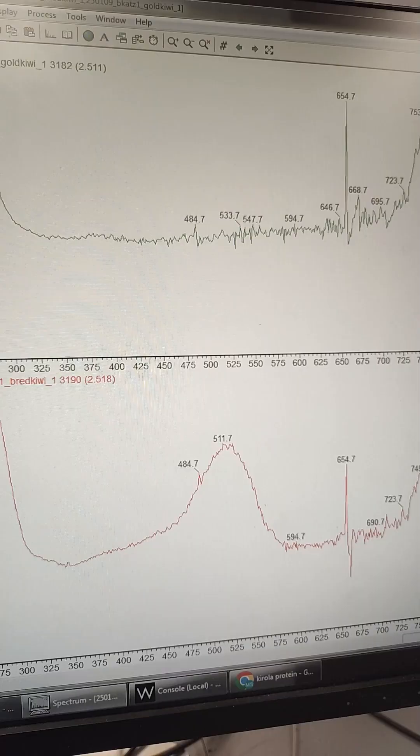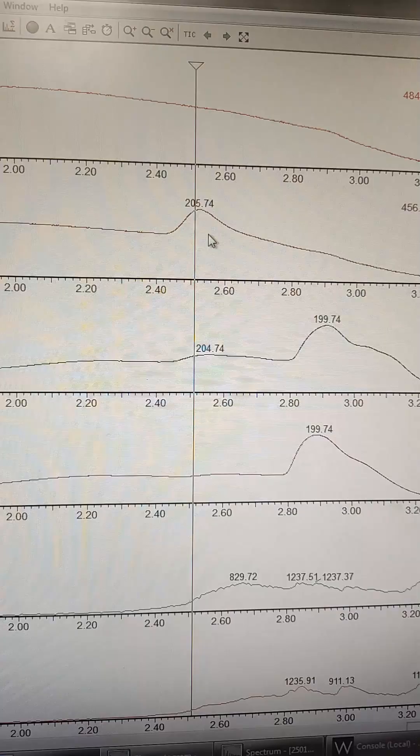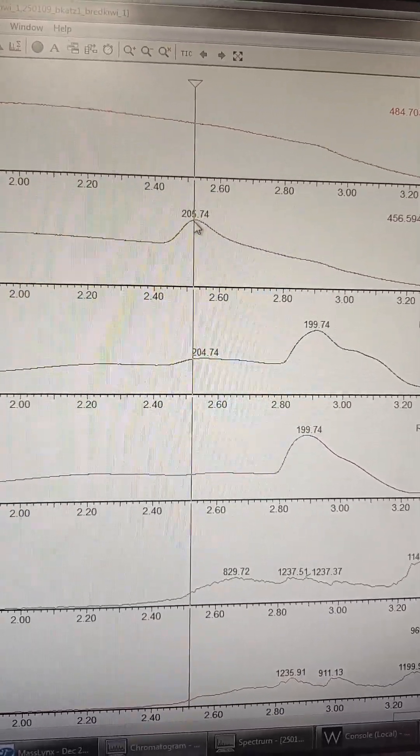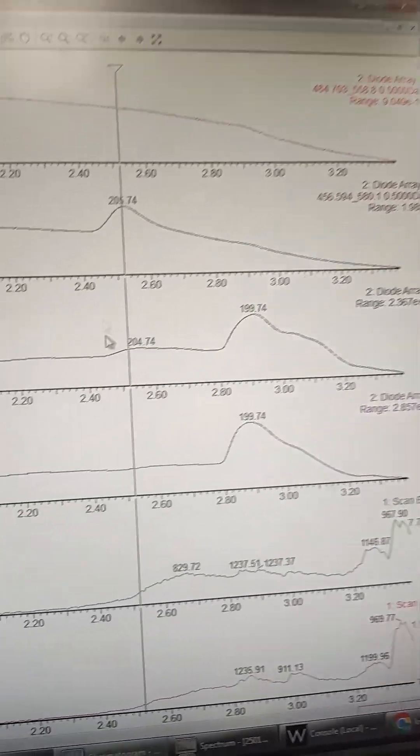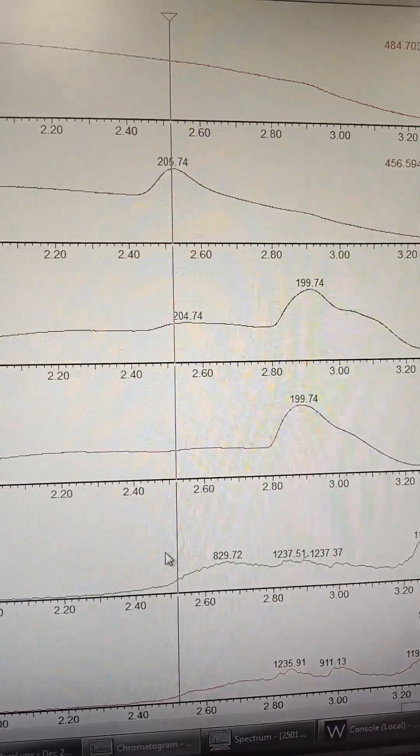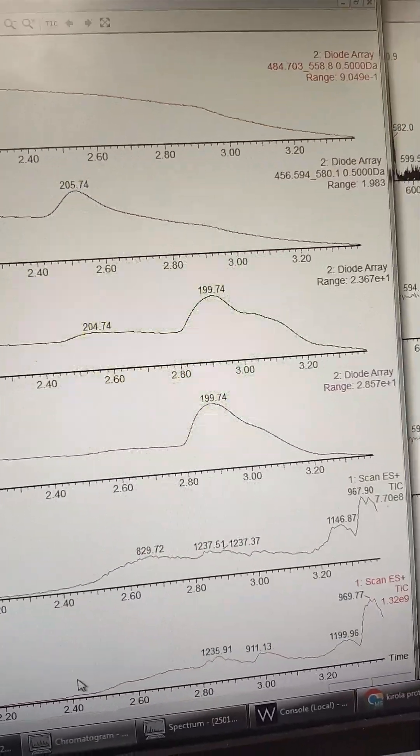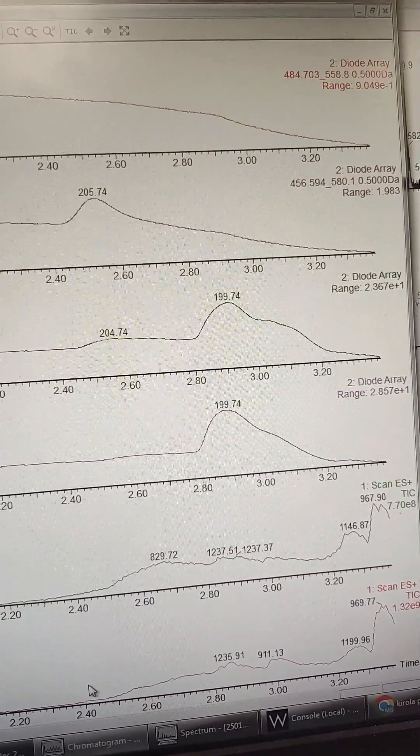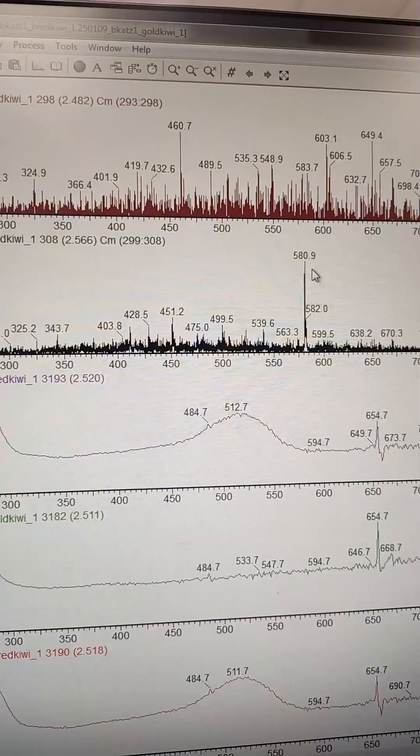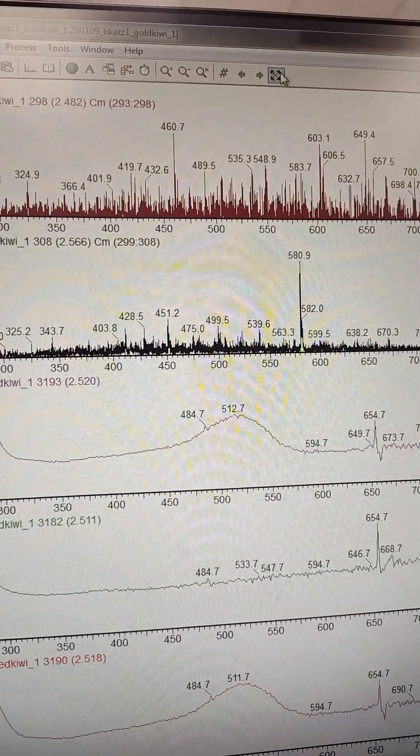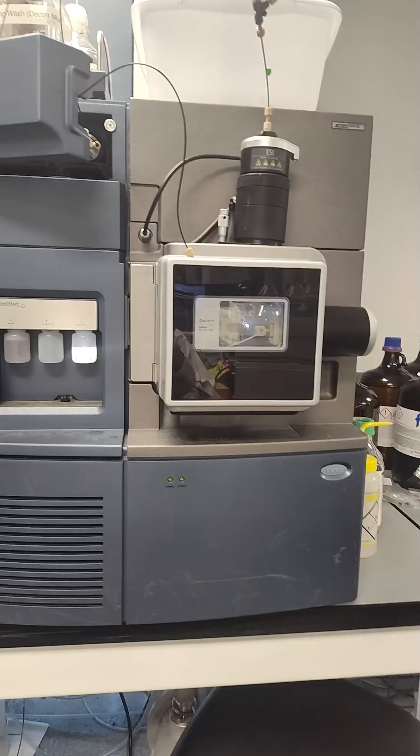So we're going to extract that out from the red. Same area from the golden. And so there's the peak that corresponds to that right there. And you can see that's that red pigment, the anthocyanin pigment. So to figure out that mass, you want to go ahead and align that area for the mass from the red versus from the golden. And the peak that's new is this peak at 580.9. So 580.9 is that red pigment mass. Let's try to figure out what that is.